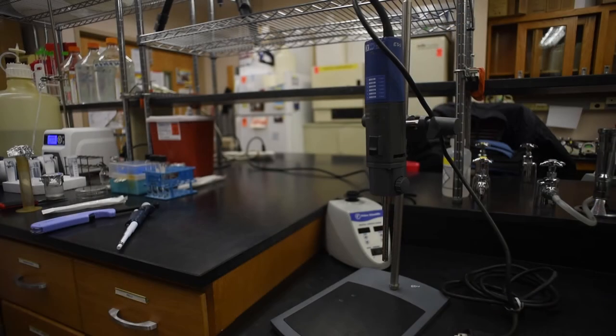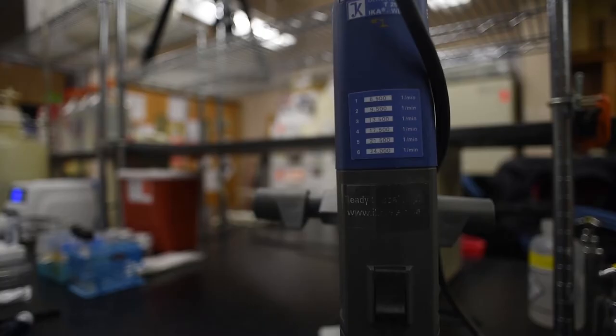To disaggregate the biofilm, use a homogenizer set at 20,500 RPM, plus or minus 5,000 RPM. The settings are shown here.